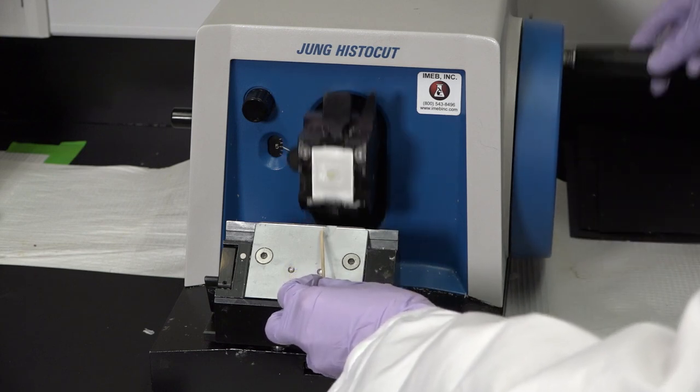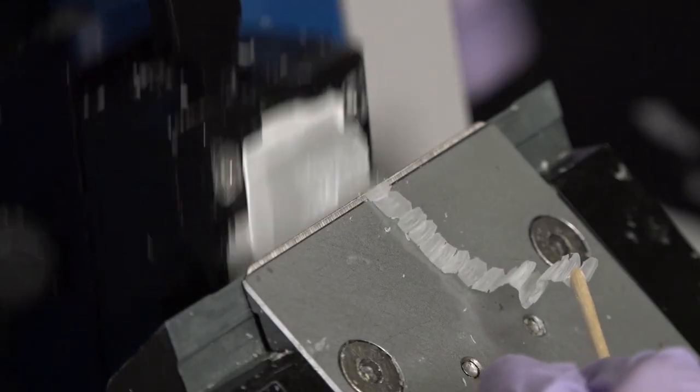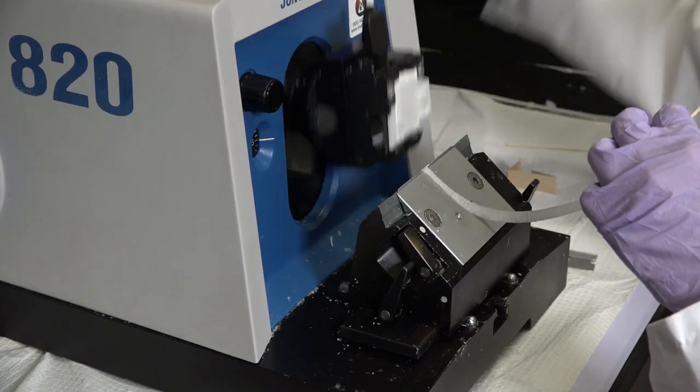We call this slice a section, and it's only a few micrometers thick. And I'm gonna keep turning the wheel to make more sections, and they'll stick together and soon a ribbon of sections will form.